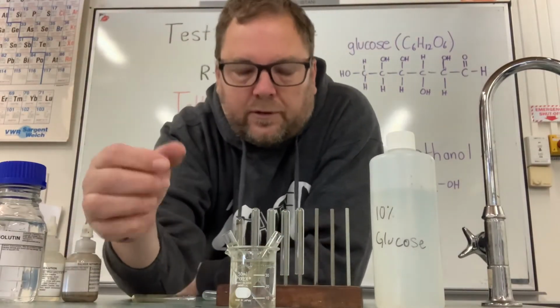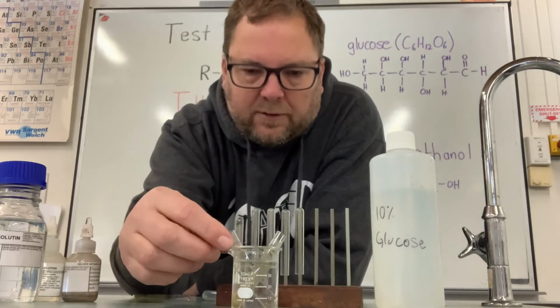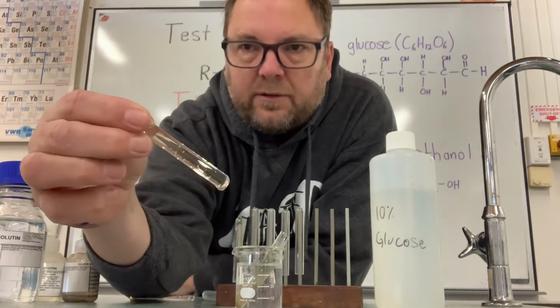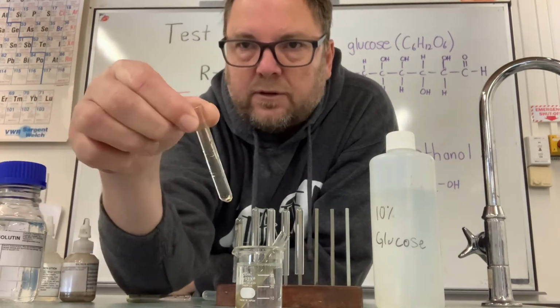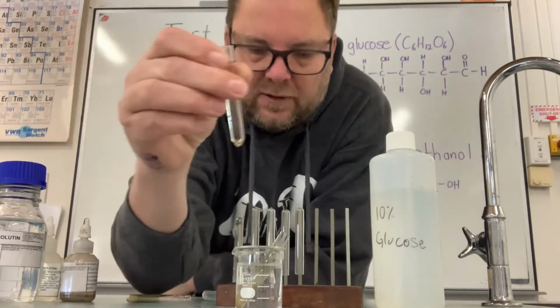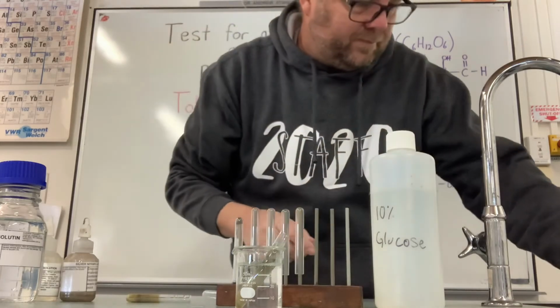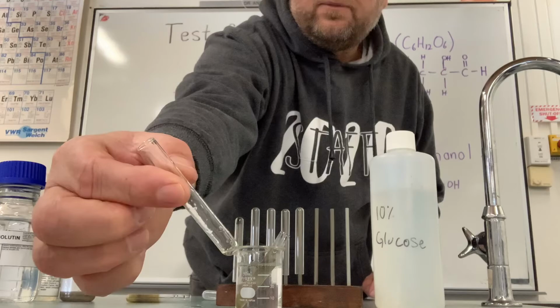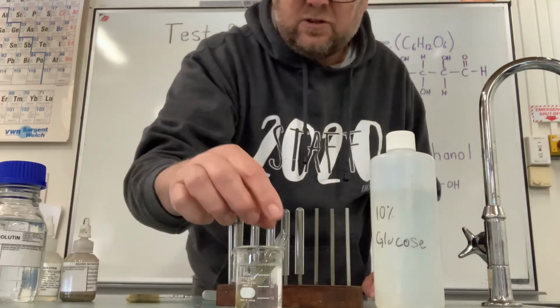As always, when you try and do something in a video, it doesn't work fantastic, but it's worked okay. So firstly, if we look at our test tube with the ethanol, we don't see any sort of evidence of a reaction there. It looks pretty much like it did at the start. So there's our test tube there after we empty it. Not really any major change.